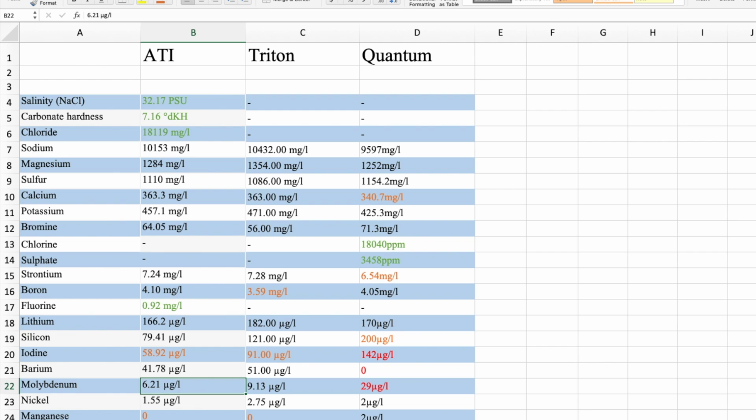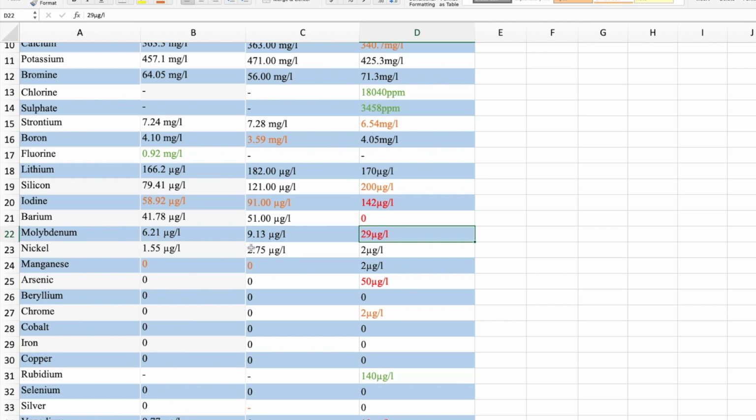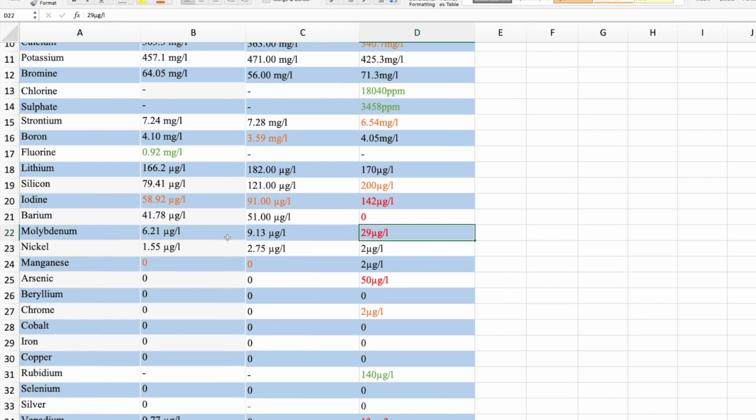Molybdenum, I don't know how you pronounce that, but let's go with it. We've got 6.2 here, 9.1 here, and then 29 there. A huge variance, quite a few hundred percent. Because these two are so close, or close-ish, and this one is so far out, I'm going to assume the Quantum result is the one off here. It may not be the case. That one might be right and these two might be off, but I'm going to go with safety in numbers here.